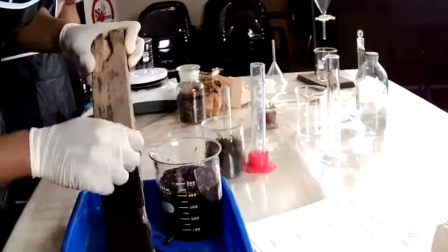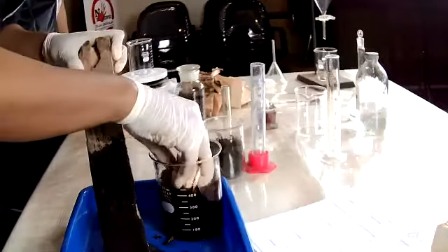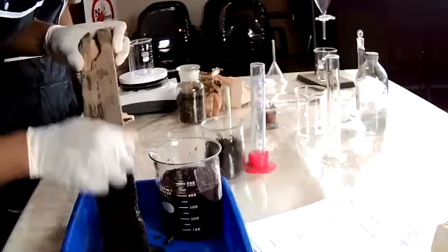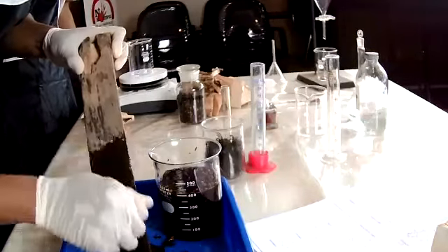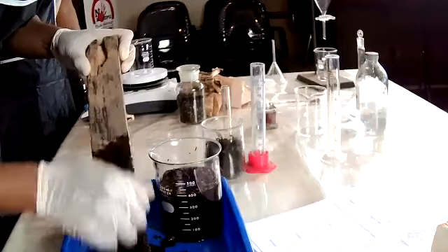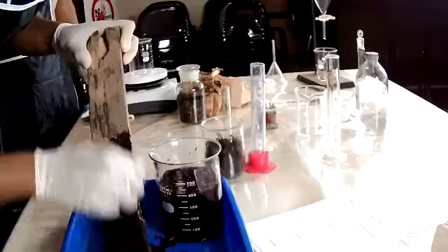So I'm only cleaning or scrubbing one side of this wood for the purpose of this hands-on. But in real life, if you're following this method, then you have to clean the whole part of the items that you're cleaning.